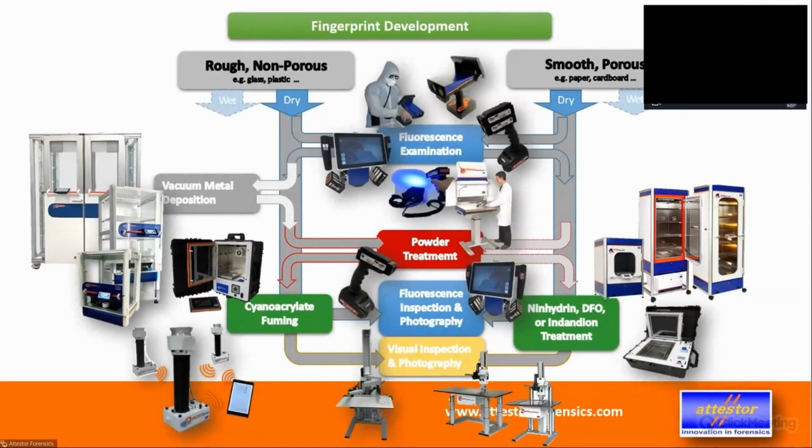So this is basically a cyanoacrylate fuming chamber in a box, in a wheeled trolley. Exactly the same type of controls, exactly the same safety, the same type of filtration and so on as you would have with the big laboratory-based systems.